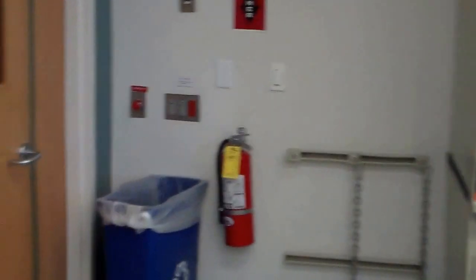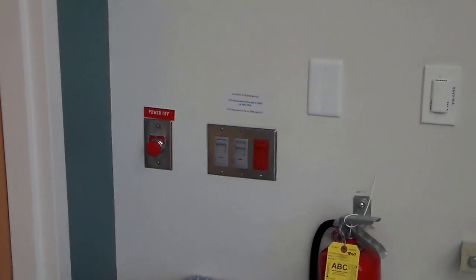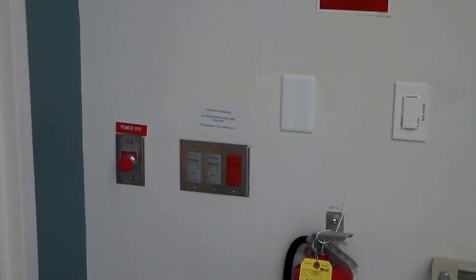Over that corner by the door there's also the power off master switch for the room. If you ever encounter an electrical hazard, slap that button and the entire room will shut down.